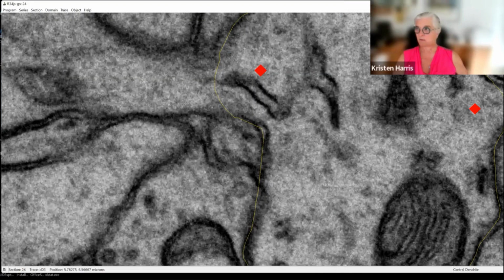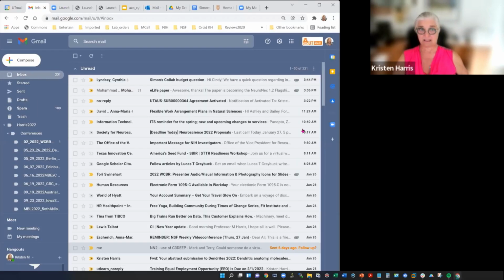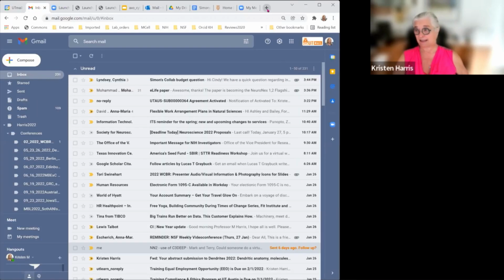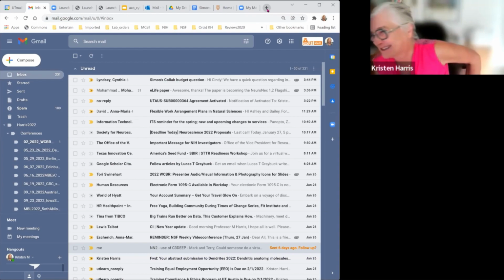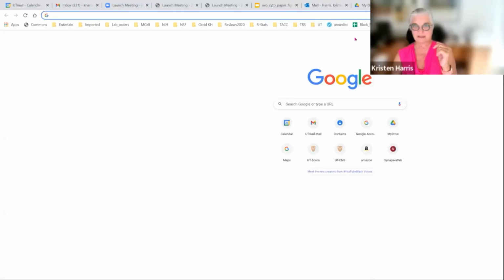And so then let me just go one step further to show you where you can get access to Reconstruct, in case you haven't already done so. But I think you guys are right on the cusp. And in fact, the next thing on your line, Tom, is integration of NeuroGlancer, or of alignEM-SWiFT, with Reconstruct Plus. So literally that's the next thing on your list. Yeah. So the timing to me is just perfect for Joel to become also familiar with Reconstruct.